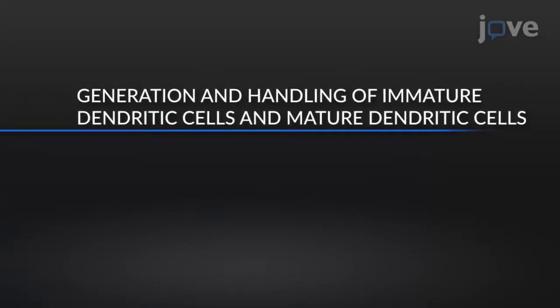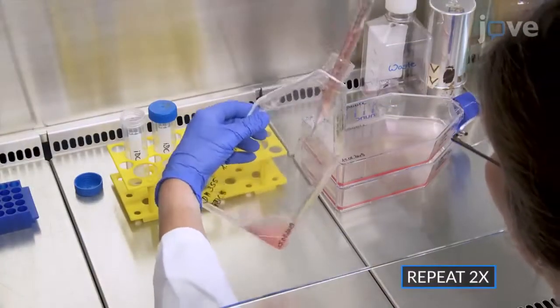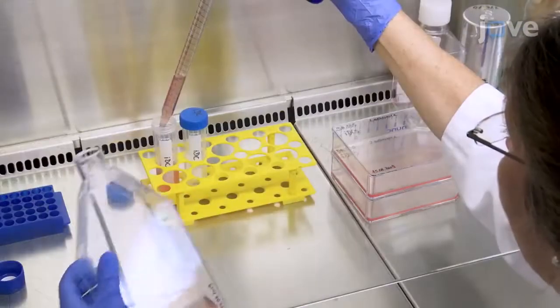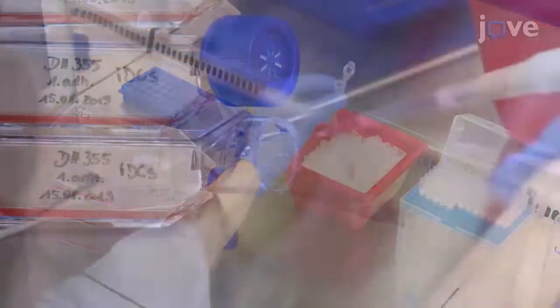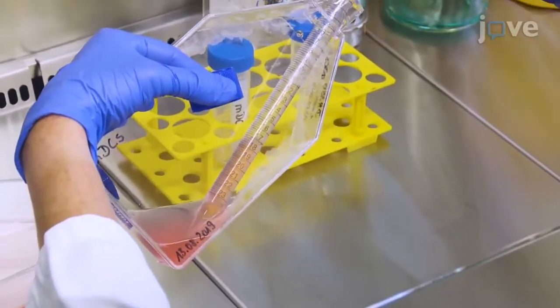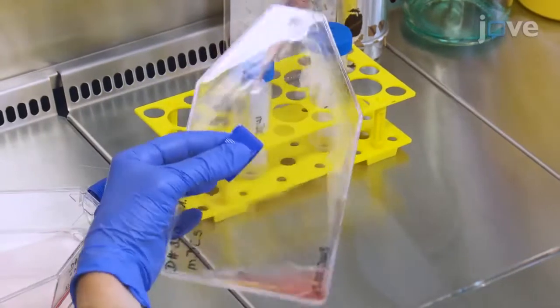Begin by harvesting immature dendritic cells, or IDCs, by gently rinsing the loosely adherent cells from the bottom of the cell culture flask on day 4 post-adherence. Add maturation cocktail to the cells to generate mature dendritic cells, or MDCs. Two days after induction of maturation, rinse the MDCs from the bottom of the cell culture flask.